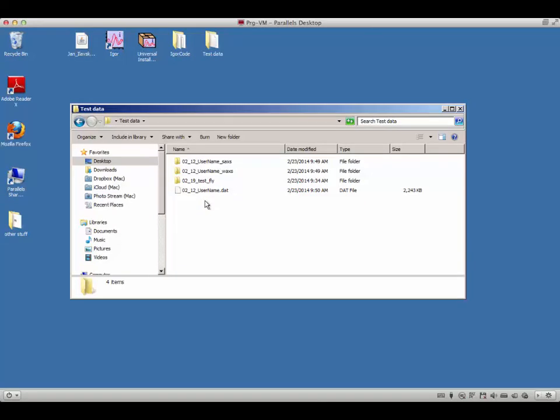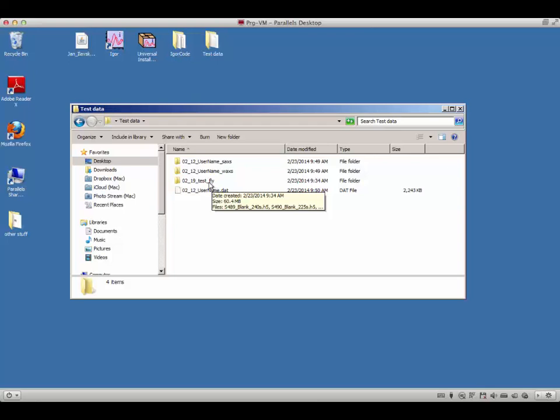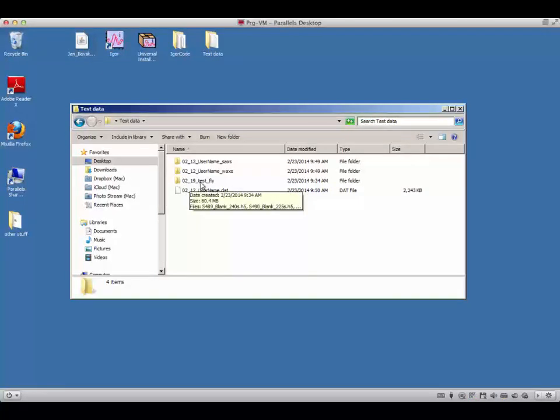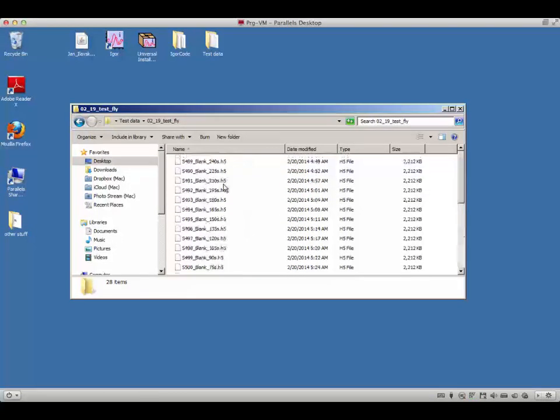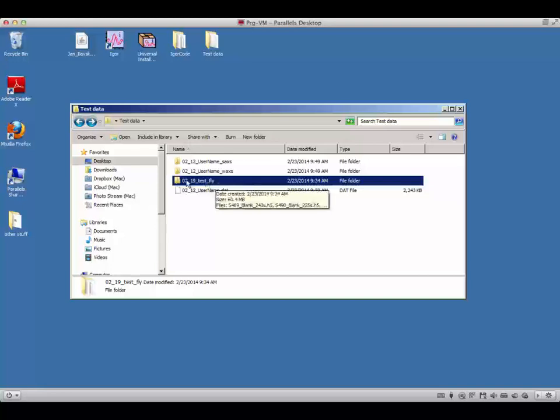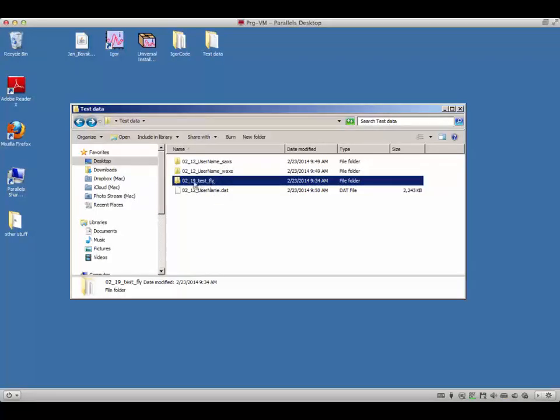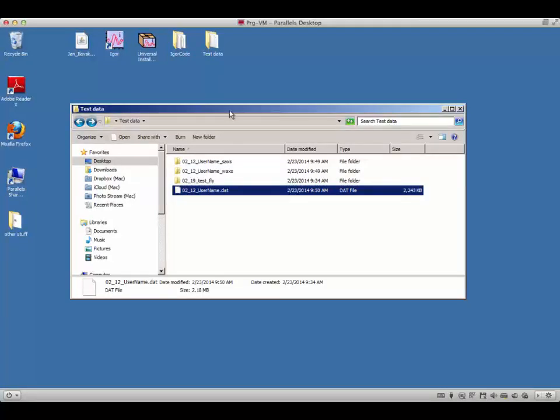This is how the USAXS was collecting data with step scanning basically since 1999 until about 2014. Currently, there is a second option: fly scanning. It's not a step scan through the angular range but a fly scan through it. In that case, the data are not inside the spec file but in a folder containing HDF files. These HDF files represent a Bonse-Hart USAXS dataset collected slightly differently, but they reduce very similarly to spec step scans and can also be combined with SAX and WAX data.